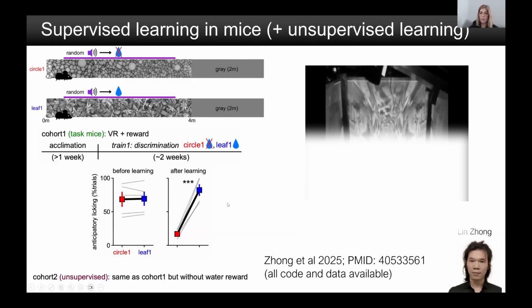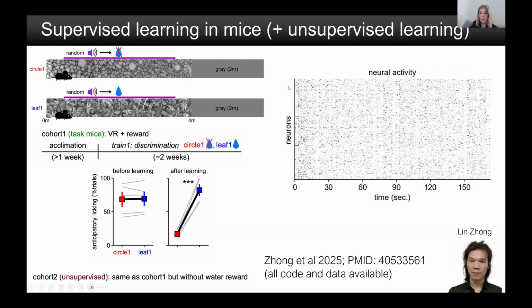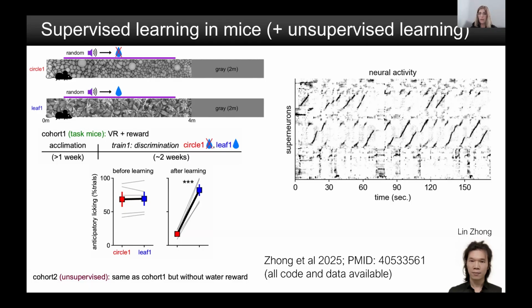I won't show that, but basically we have this big plot of neurons by time. We can't average over trials. So instead what we do is we average across neurons. We put neurons that are correlated to each other next to each other using Rastermap, and then we get a plot that looks like this, and we get sequences during the corridors, and you can see these breaks, and the sequences are actually when the mouse is stopping running. So we can see those things more easily when we're making a plot of neurons by time and averaging over neurons here, because single neurons are noisy.